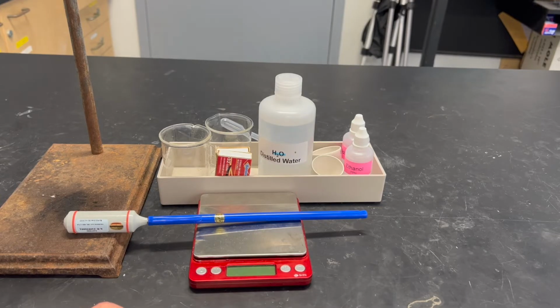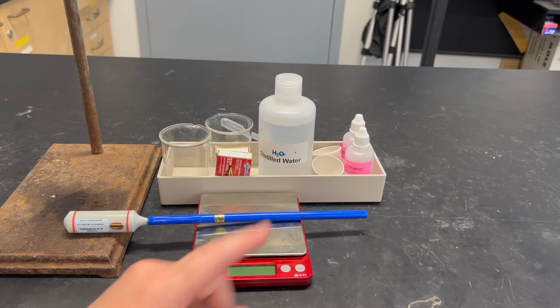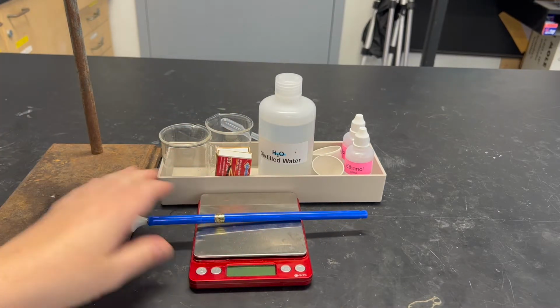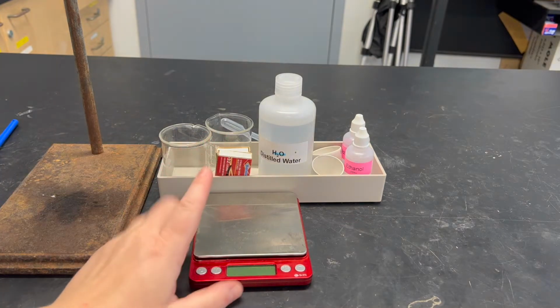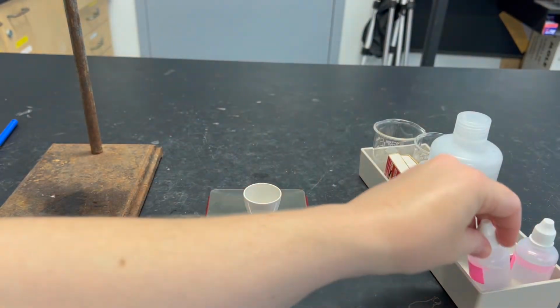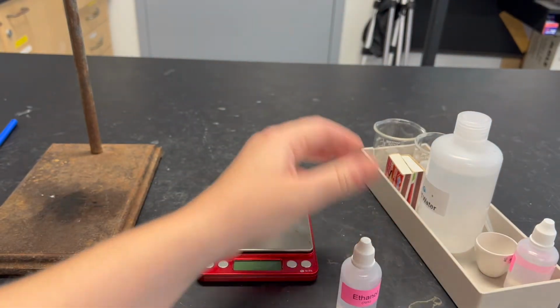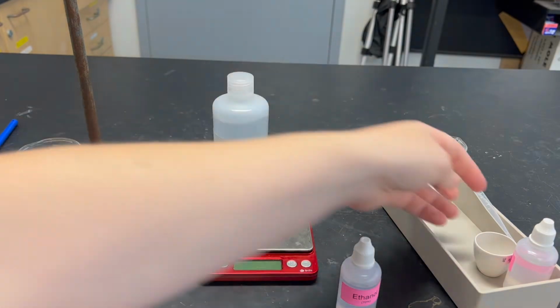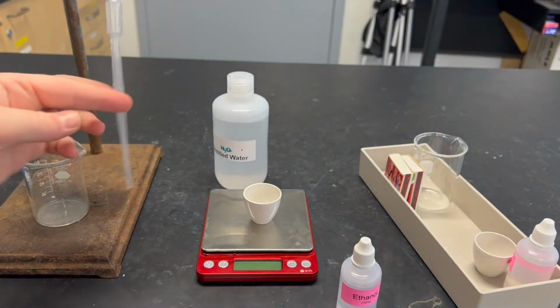In this part of today's assignment, we are going to be burning ethanol and heating up water. I'm going to show you how to do that. First thing is you need a scale. You need a little crucible. You're going to need a bottle of ethanol, a beaker, distilled water, and a pipette.